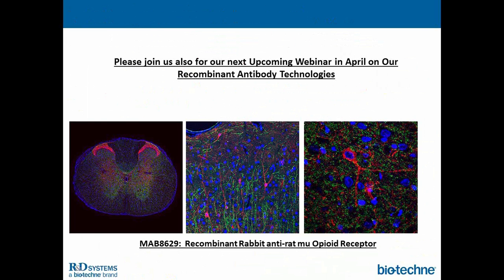I would just like to know, we no longer do chemiluminescence in the laboratory. We use infrared dyes. And would the results be the same? Let me ask you a question in return, not to get around the question. Are you using primary? You're using secondaries with IR dyes, is that correct? Only secondaries. Okay.